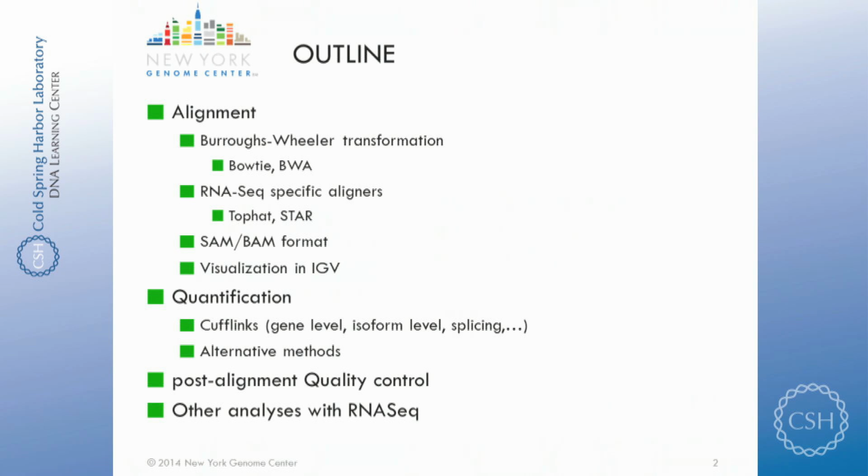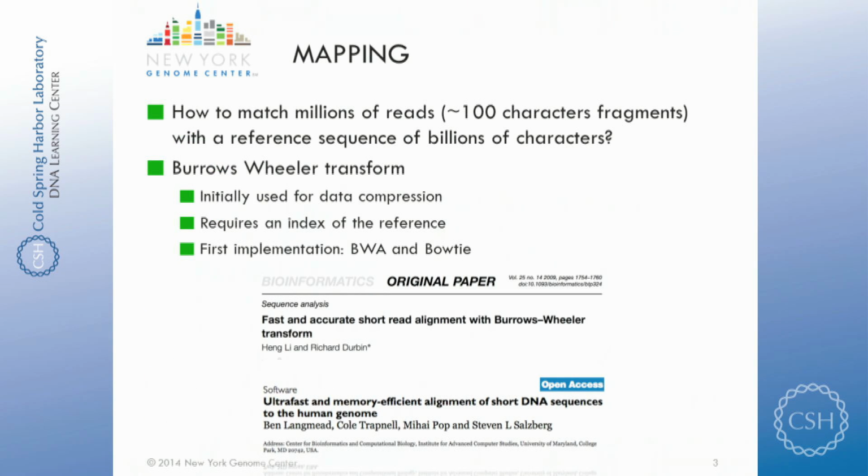Possibly we'll get back to the other computer and see the different parameters that are accessible for TOPHAT, so we can discuss all of them and see which ones are the best for your own purpose. I need to mention a few other analyses that are possible with RNA-Seq as well.